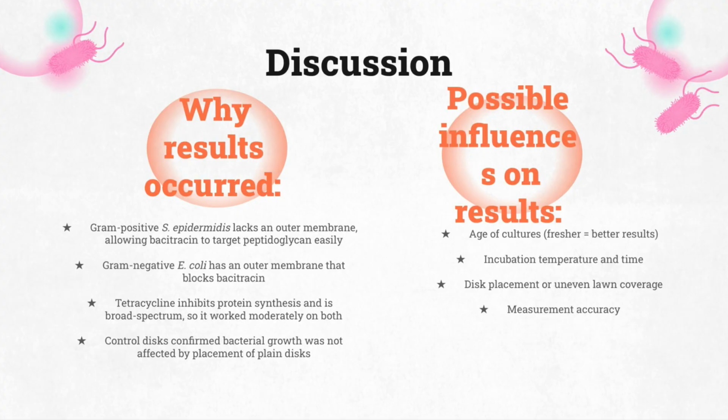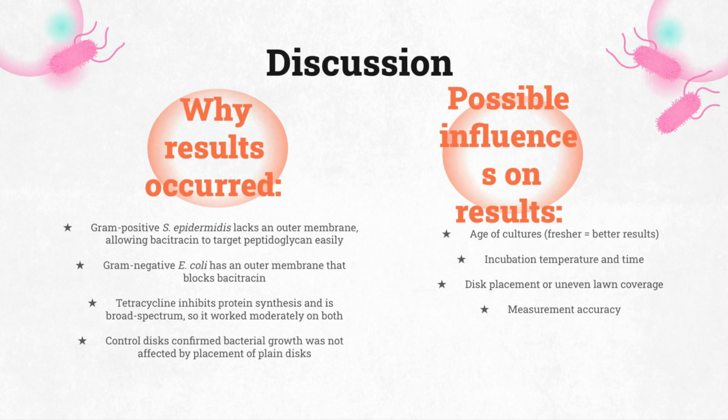There are a few factors that also could have influenced my results, like the age of my bacterial cultures, my incubation temperature and timing, whether the discs were placed evenly, and how precisely I measured the zones. Still, I feel overall the results were clear and consistent.